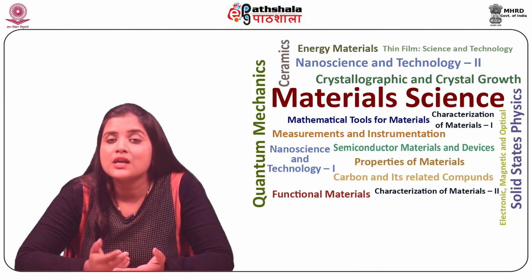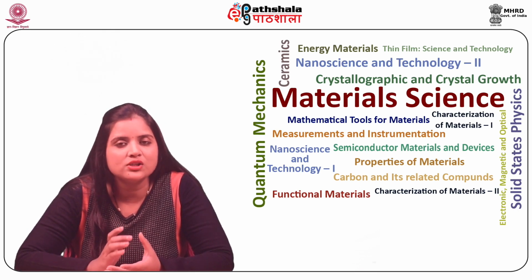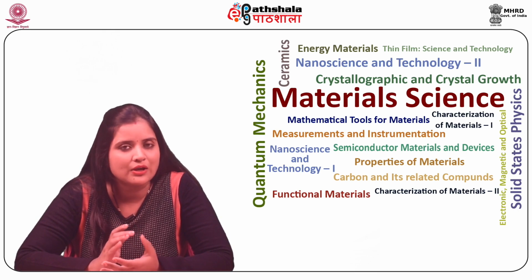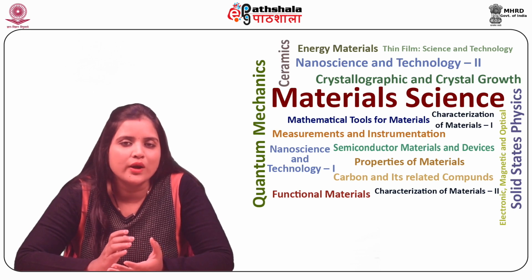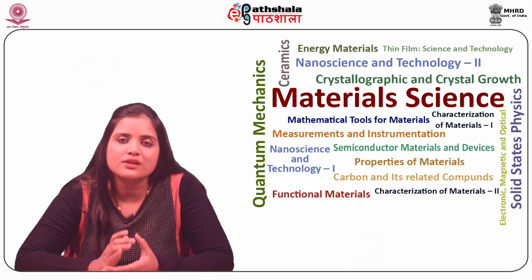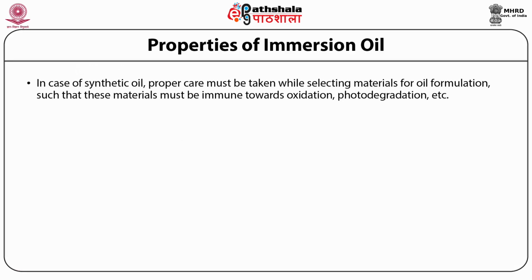Most of the manufacturers immerse the objective in the oil while optimizing the particular oil to be used in microscopes. This test is conducted to verify various properties of the oil such as acidity, solvency, etc. In case of synthetic oil, proper care must be taken while selecting materials for oil formulation, such that these materials must be immune towards oxidation, photodegradation, etc.